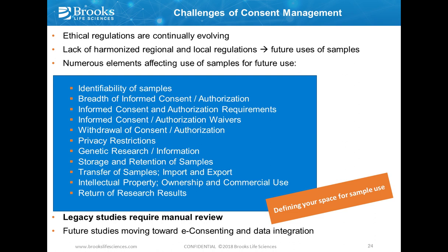Going a little bit more into detail, we need to ensure the identifiability of the sample. At the same time, we need to ensure that the donor is not identified. We need a clear view on the breadth of the informed consent, the authorizations we have in place, and the requirements we have to put in place to keep control of this. Then withdrawal of consent, we need to take care of this, and the longer the sample is held, the more difficult this is. Like receiving a withdrawal after 15 years in the organization, that doesn't happen that often, but that may provide us with considerable challenges, depending on how we are organized.